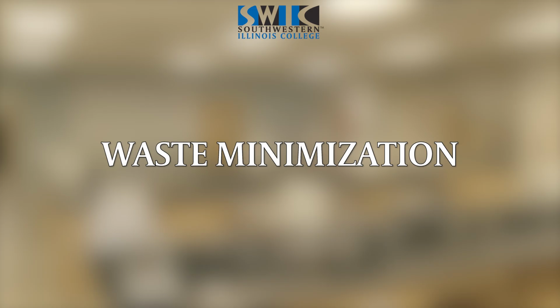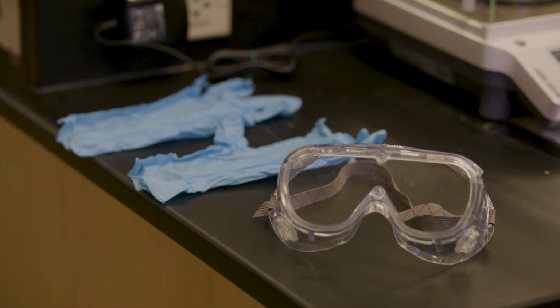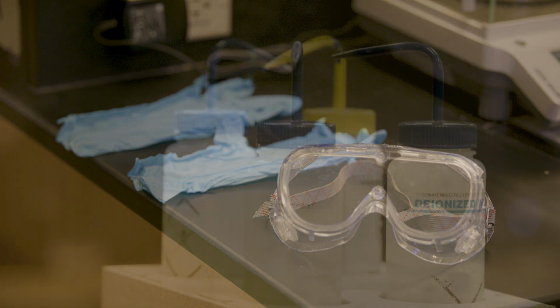Practice waste minimization. Use only the quantities of chemicals you need for experiments in order to reduce waste generation. When handling hazardous waste, wear appropriate personal protective equipment, such as goggles and gloves. Always be prepared for spills or accidents.